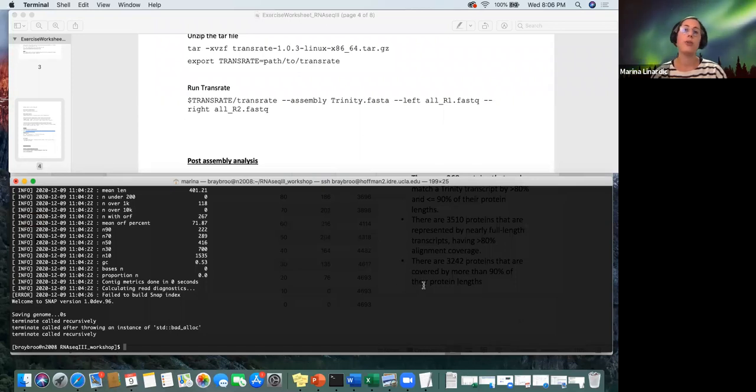So when you're doing a full assembly, it gives you something called the assembly score, and it can go from 0 to 1, so 0 to 100%. And the closer that number is to 1, the better your assembly is. If you have, for instance, a 90% alignment rate with Bowtie, you would expect to have at least like 0.8 or 0.9 here as well as your assembly score.